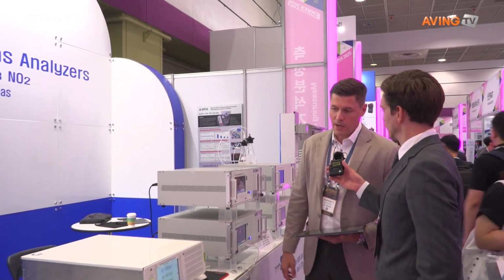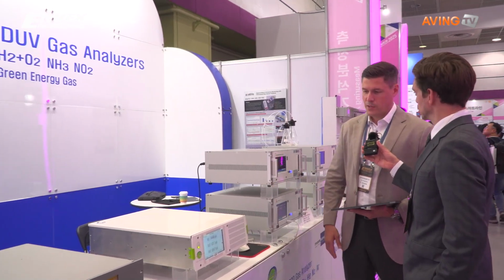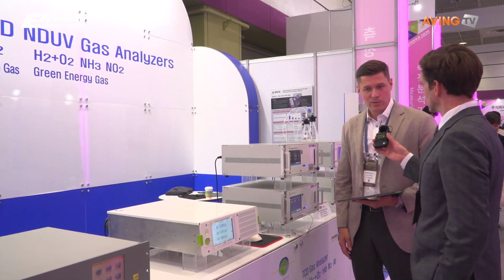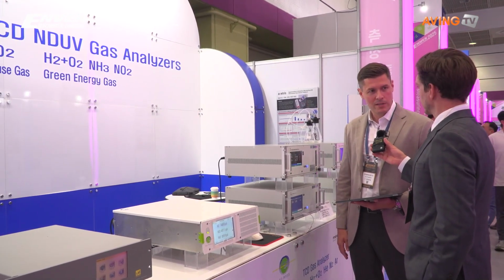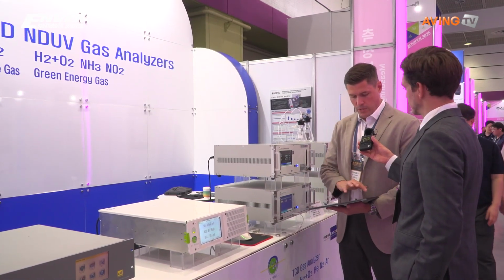And I'm here for the CLD technology from a company called Ecophysics. The name comprises ecology and physics. Basically, that is our mission. So we develop analyzers to determine, for example, ambient air quality, emission monitoring, but also gas components for gas manufacturing. Everything has its physical characteristics, which we determine by the chemiluminescence principle. And that is actually our latest development, which I can show you here.